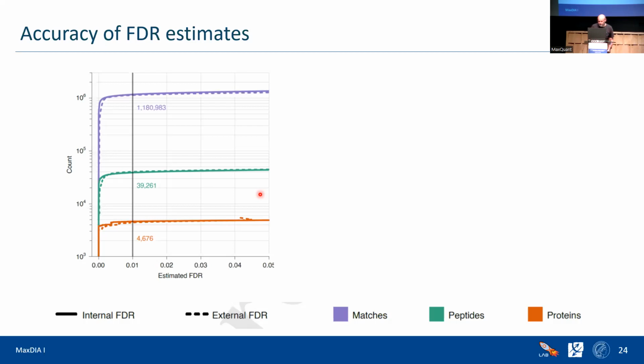So that's good. That means our FDR estimates are correct with some caveats. As I was mentioning, for example, this overinterpretation by using fragments twice and three times, you would actually not see here. But for those things that we are aware of that could go wrong, we took precautions that they don't go wrong, basically. Going over what you can see in the external FDR benchmark.